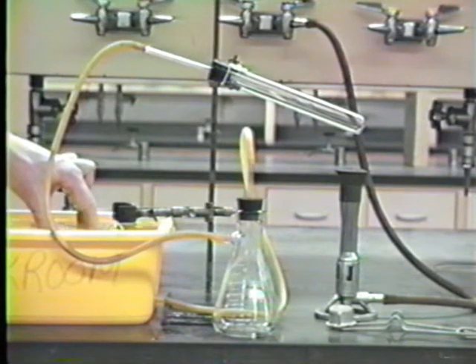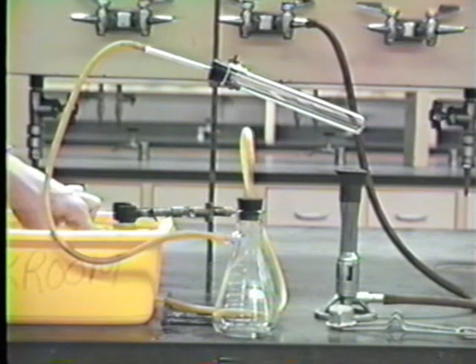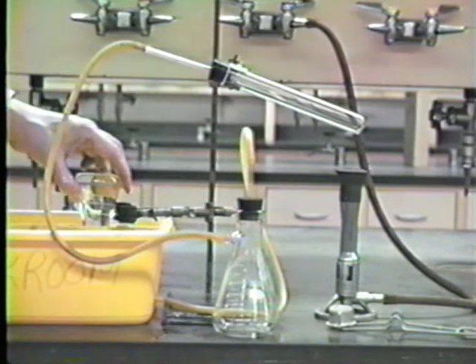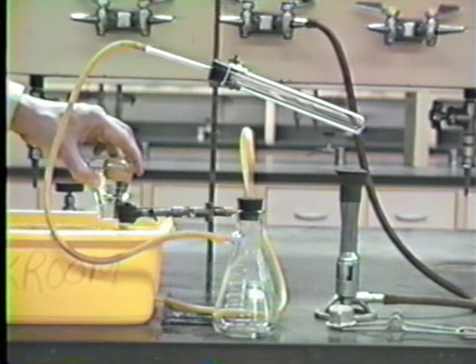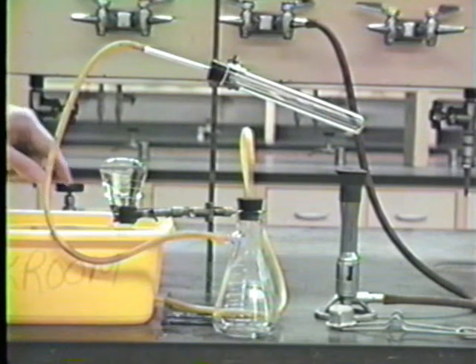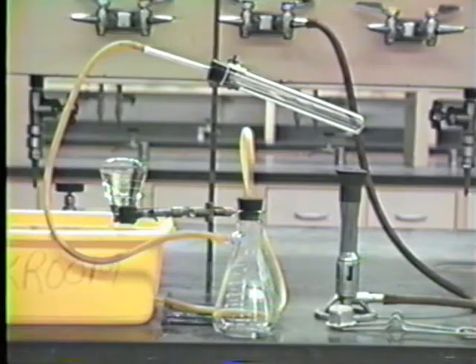To set up the collecting flask, you merely fill this up with water completely, and then when you put it out of water, do not take the opening out of water, and just hang it up so that the opening remains underwater. Now your flask is completely filled with water, and it'll be only the oxygen which displaces this, as far as the water is concerned.